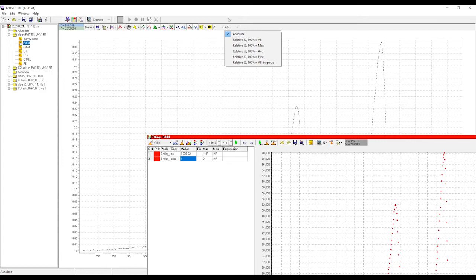So when you do some quantitative analysis, you can normalize spectra directly on sensitivity factors, or maybe on cross sections. And I think there was an idea that he wanted to include the library, for example, Specs Prodigy has its own library. So after we measured the spectra, you can choose elements which you expected to see on the spectra, and you will automatically see all peaks from those elements.